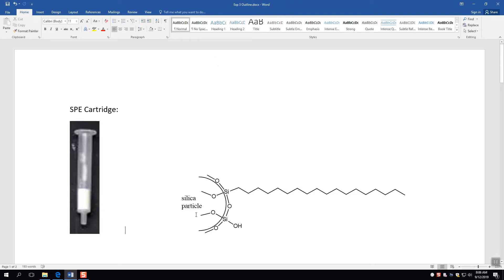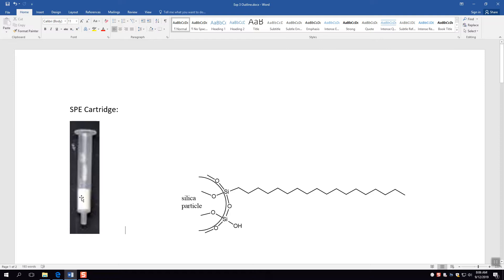What we're trying to do here is solid phase extraction in this experiment. Solid phase extraction is similar to liquid-liquid extraction if you've taken organic chemistry before. If you haven't, you'll get to it relatively soon. But basically what we are doing is using a solid substrate in a silica gel cartridge. And this is what the cartridge looks like. You'll notice that this also looks like a typical plastic syringe, and it turns out that it is a typical plastic syringe.